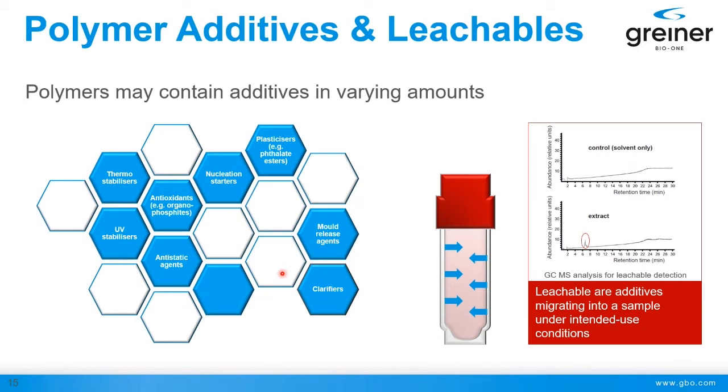And the whole science around this discriminates between leachables and extractables. What we talk about is leachables, because leachables is everything that could get out, or gets out, under regular use conditions. So the entire leachable topic, when we now talk about it for a few minutes, needs to be considered in the context of storing samples at room temperature or preferably in the cold. I'm not boiling a sample, I'm not doing whatever; I'm storing samples and I preserve them.